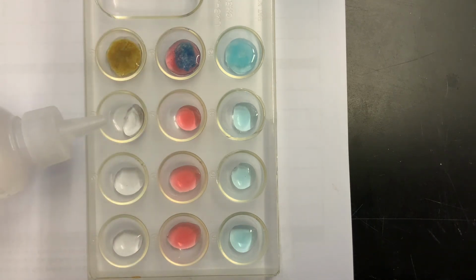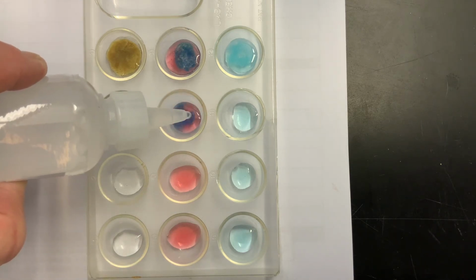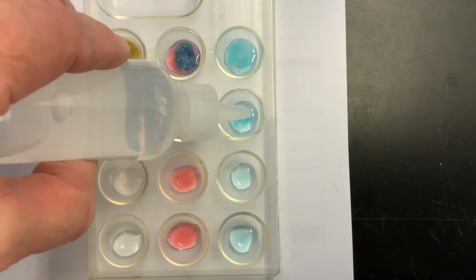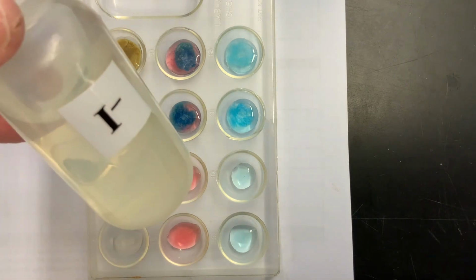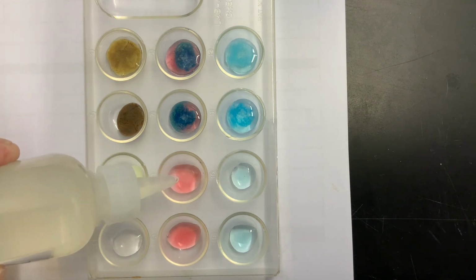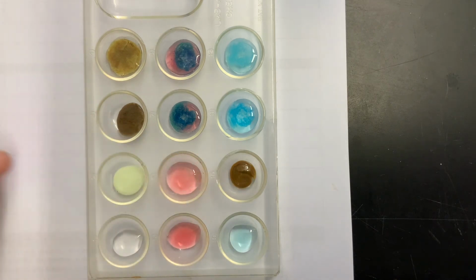Now hydroxide added into the silver, producing a brown precipitate, into the cobalt, a blue precipitate again, and into the copper, the hydroxide will also make a little more vibrant blue precipitate. Now the iodide ions: the iodide added to the silver will produce a cream yellow precipitate. Not too much appearing with the cobalt, and now a brown precipitate with the copper ions.